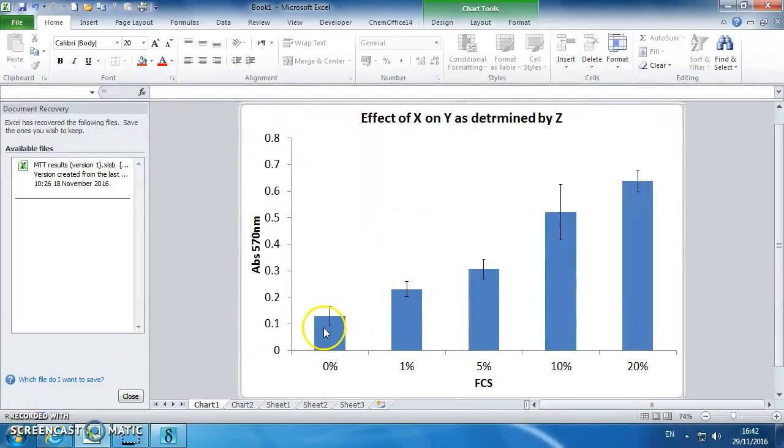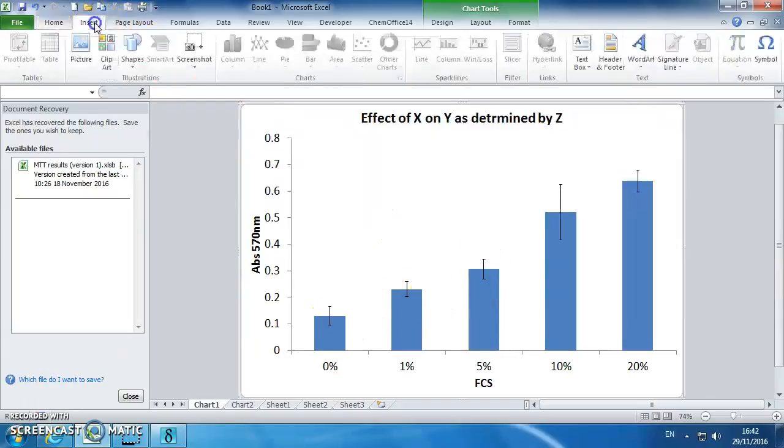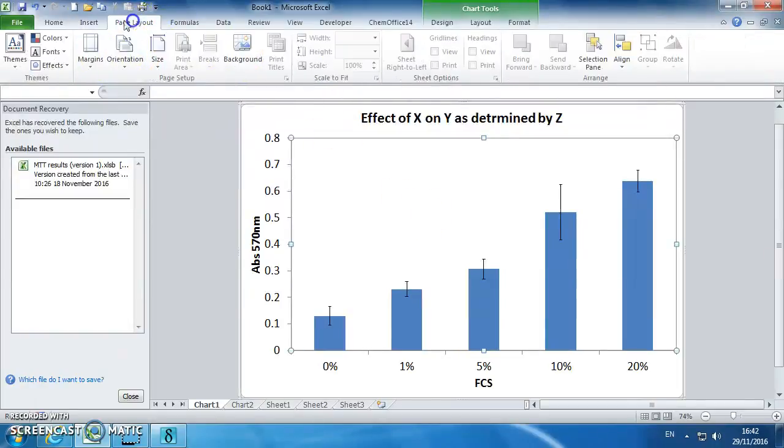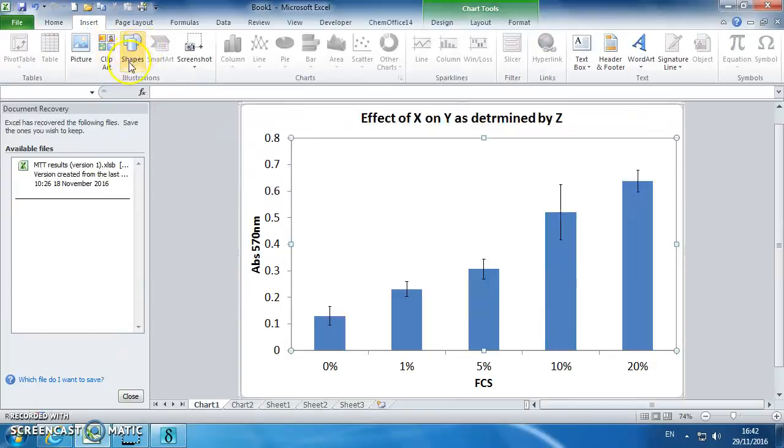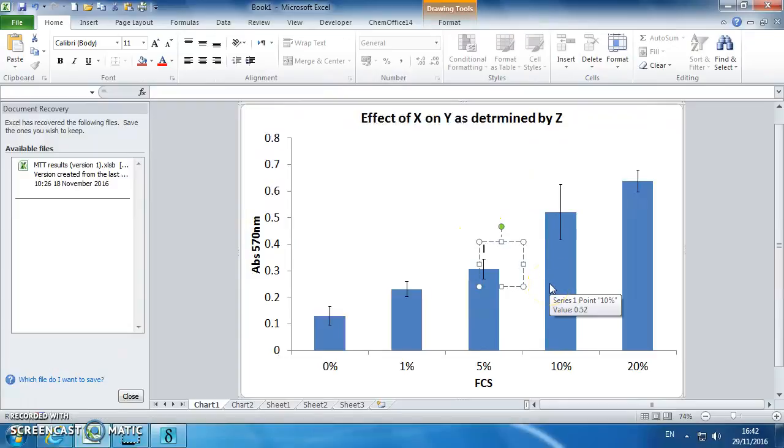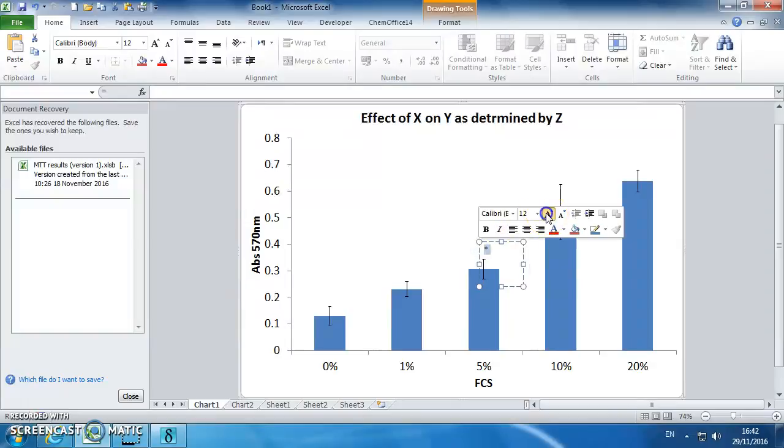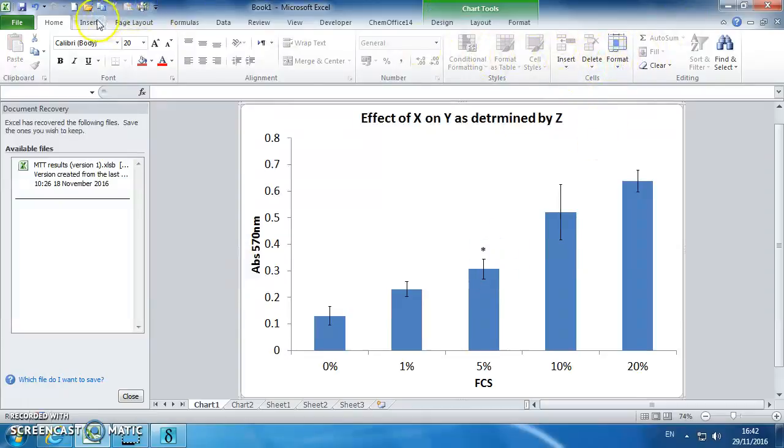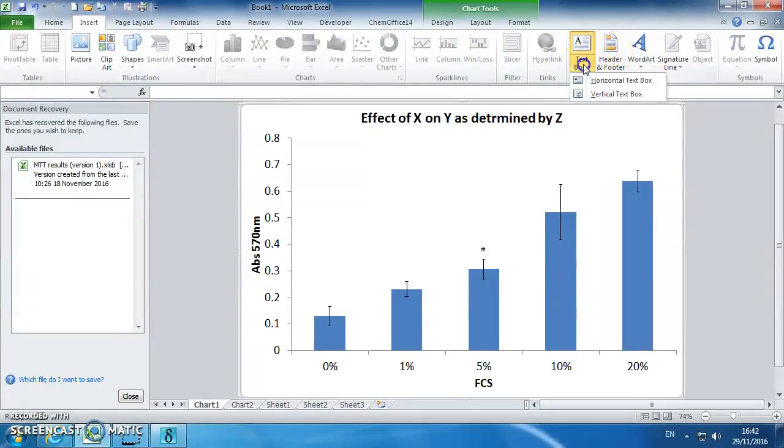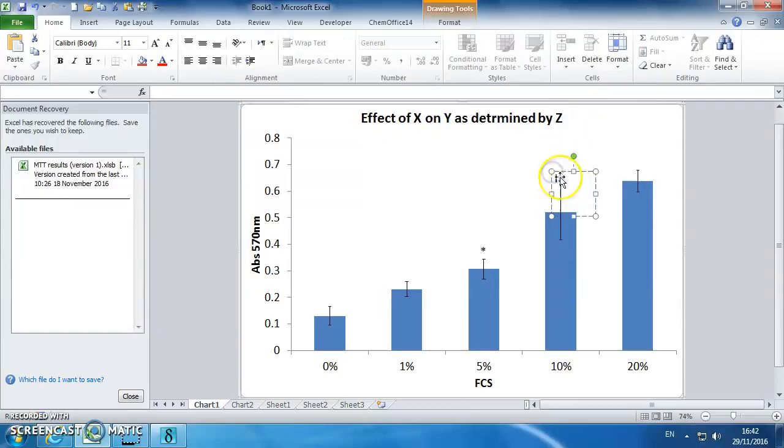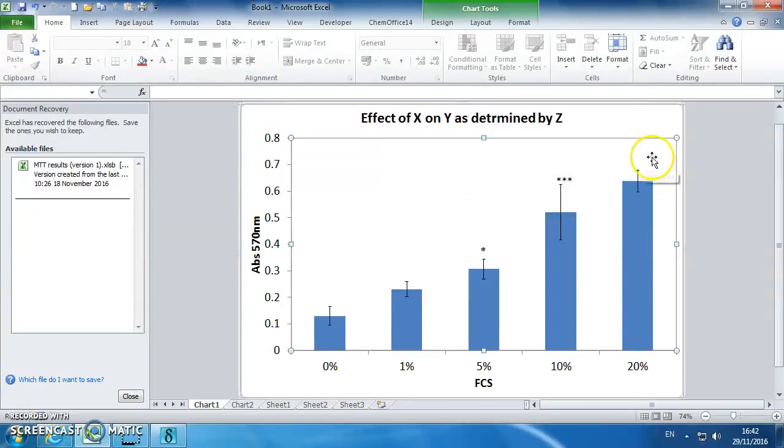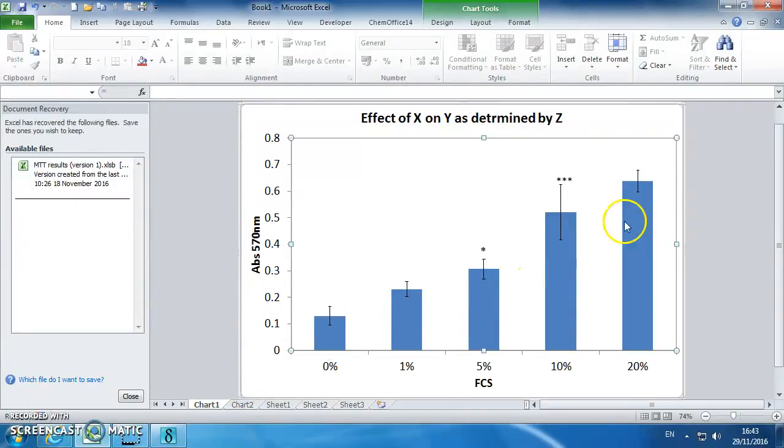And we can put these significant stars on the graph, which is here. So that is not significant, but you can just insert a text box, so insert a text box from up here. So we just put 1 star there, and then insert a text box with 3 stars up there. And then repeat the process up here. So that's basically doing a Kruskal-Wallis on this data.